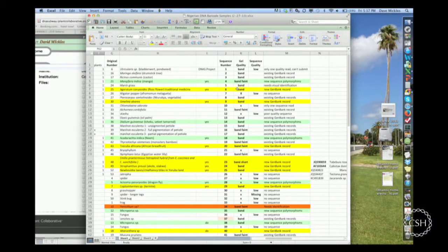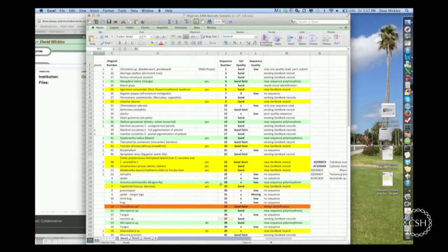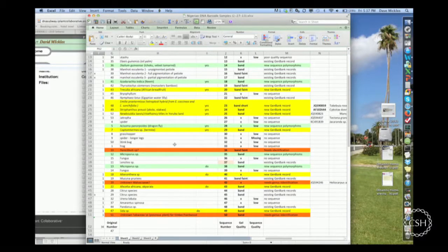So what I'm going to go through is to look for those three interesting things that I showed you: the boundary tree, the aquarata, and the dragonfly. And I know their numbers, but I'll just look them up here quickly. So the dragonfly is, I think, 28, yes, okay.